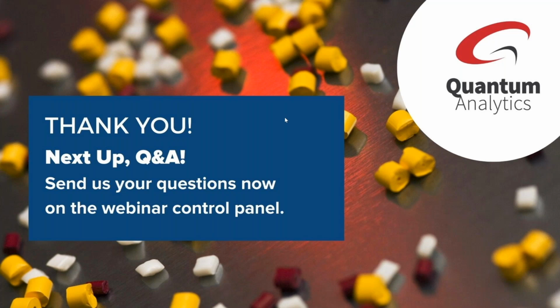And if you're interested, just submit your information, your question, through the chat, so Lauren will flag it, and I can send you the manuscript we published showing that detection. If you want to actually look at something that doesn't have a good signature in the IR, maybe nanotubes or something like that, then you would do those by Raman.